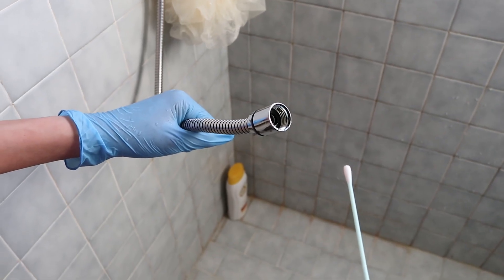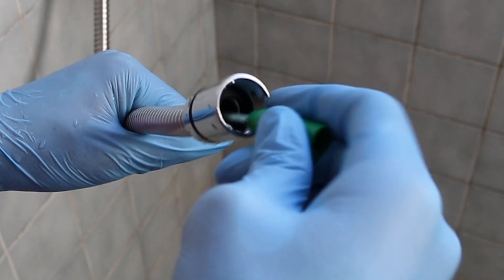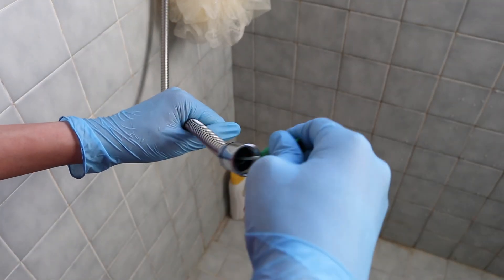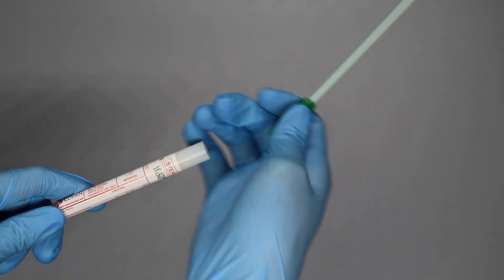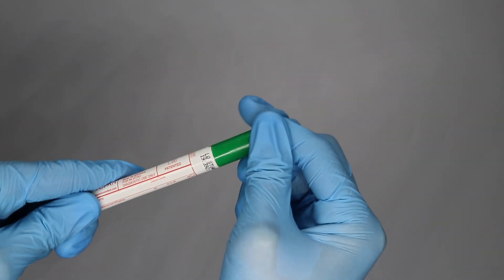When swabbing, insert the swab deep into the faucet or the pipe. Try to reach beyond the bend and swab the inside surface firmly without breaking the swab stem. Cover as much surface area as possible. After you finish swabbing, insert the swab into the tube and close the tube firmly using the bottom of the swab as the cap.